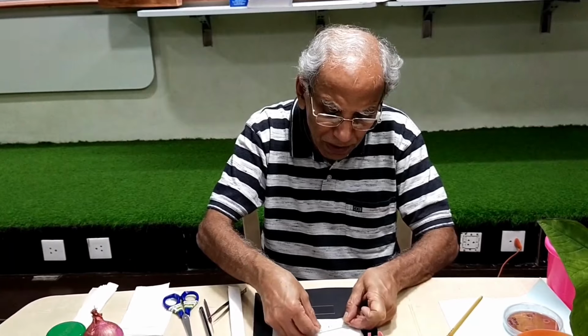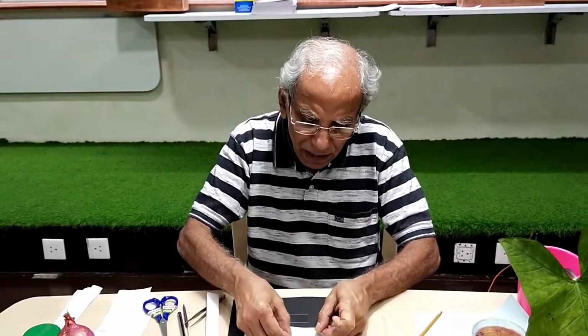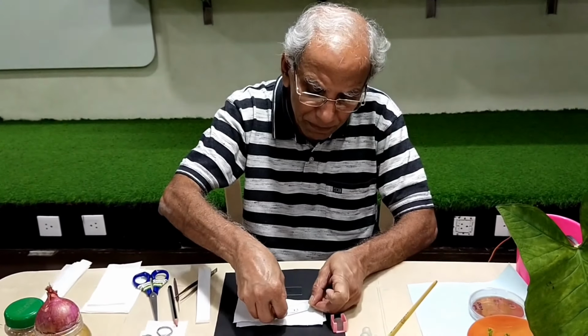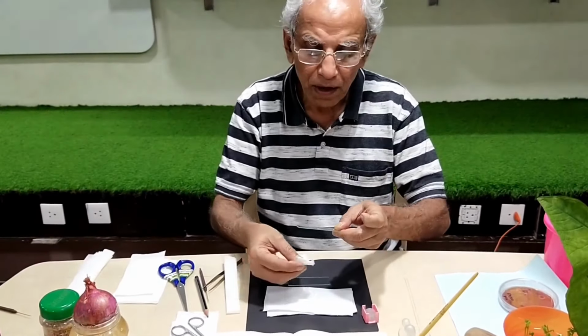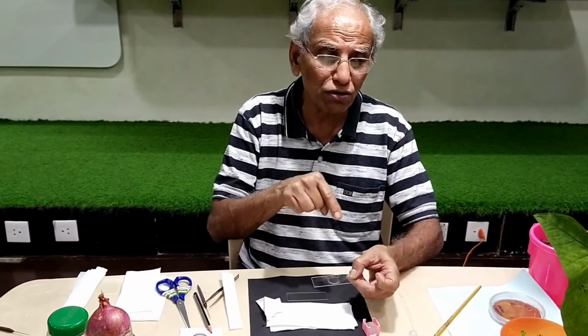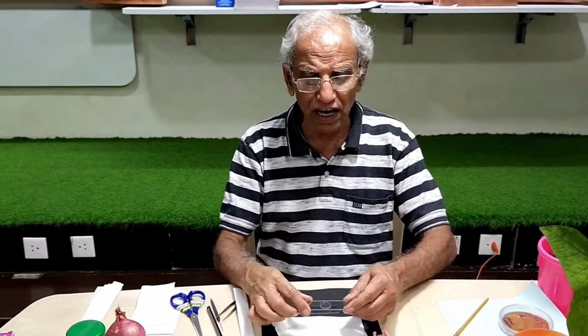Just blot away the extra liquid around, and it should be as clean as possible. Particularly it should not be wet from underside, because when you put it onto the stage of the microscope, it should not get stuck to that. So this is the slide ready now. Let's now go for adjusting the things under the microscope.